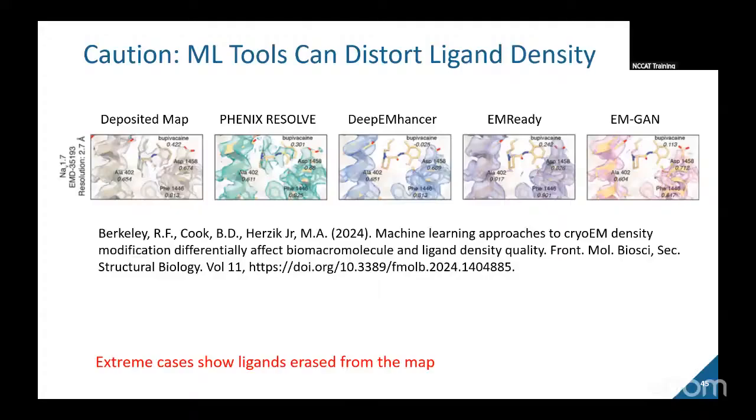Yeah, and earlier I had that example of anisotropic resolution, where the depositor gave us that. I do think there's no harm done in providing all this, making many depositions, letting them have their own EMD IDs where you can easily fetch them, and describing them well. In that case, going back and forth as I processed that entry to help understand the processing and certain limitations, they described it in the paper well.